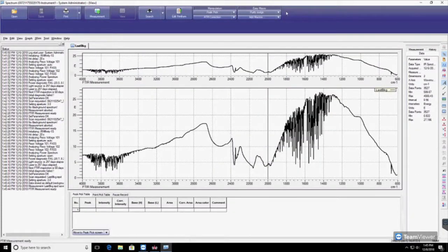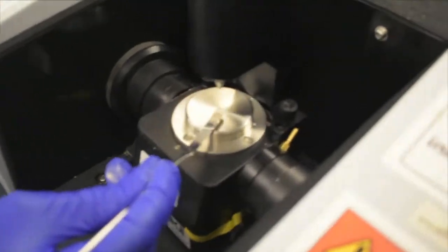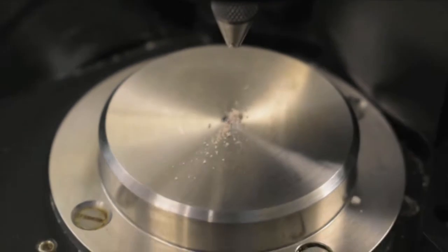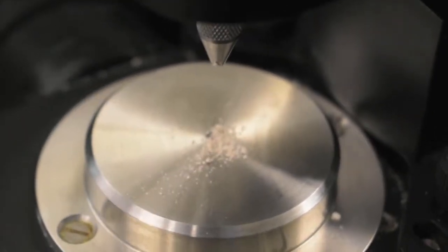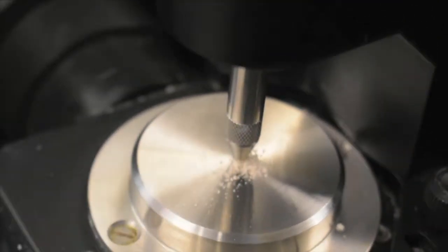When the background scan is done, you can now scan your sample. Use a spatula to transfer your dry sample onto the loading tray. Rotate the knob until you can hear a single loud click.